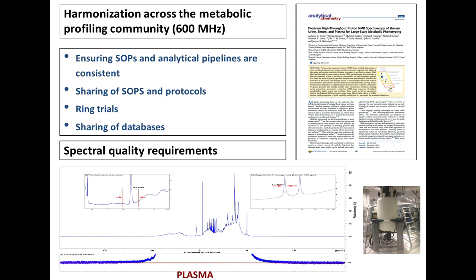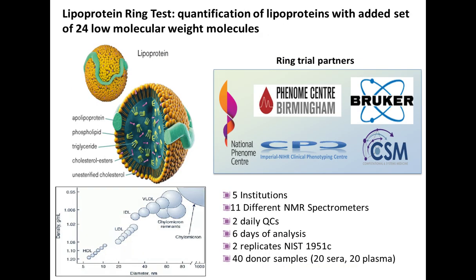So if we follow these very well-prescribed protocols, what we end up with is data that we can share. And for rare diseases, for example, this is important because we can share information on samples, real biological samples, and whilst we may not have enough in our own centres we're looking at, we can share with other centres and get a critical mass for various diseases that may otherwise not be modelled adequately.